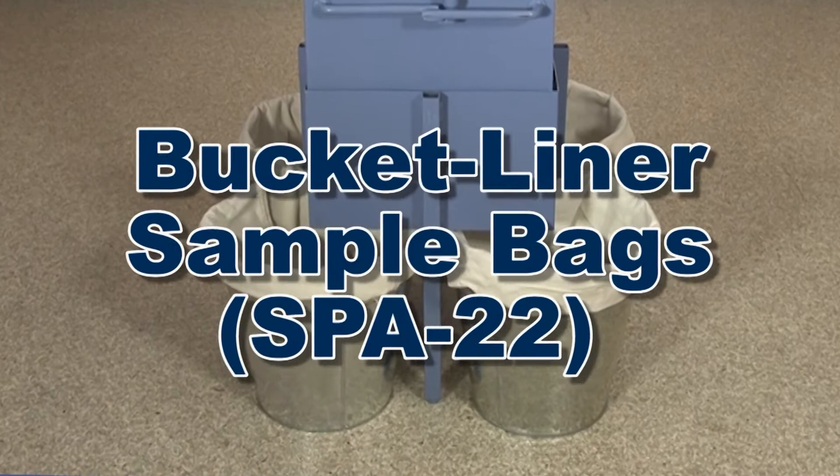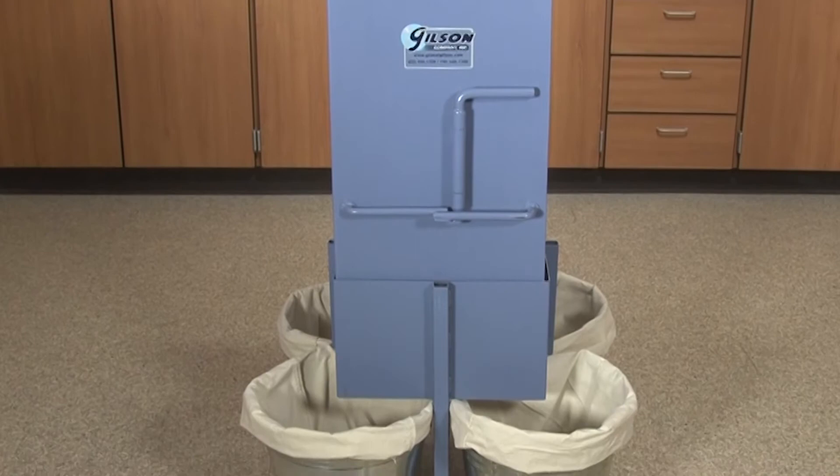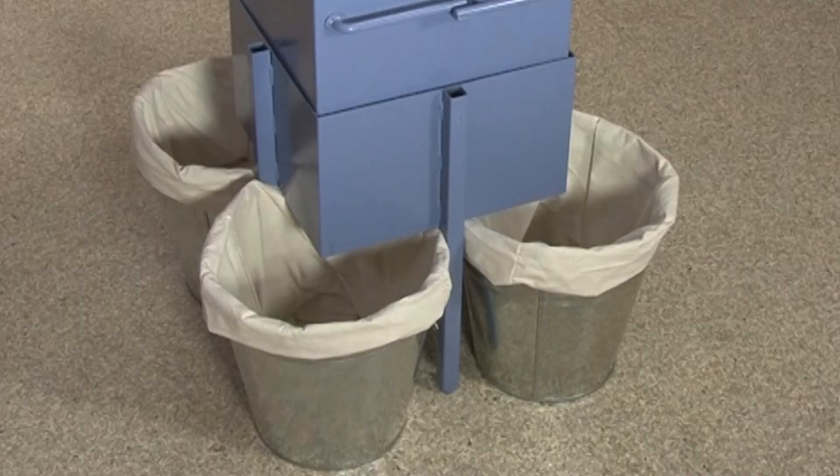Gilson's Bucket Liner Sample Bags expedite collection and handling of divided specimens and eliminate cleaning of the sample container. These sturdy cotton sample bags are temperature rated to 400 degrees Fahrenheit.